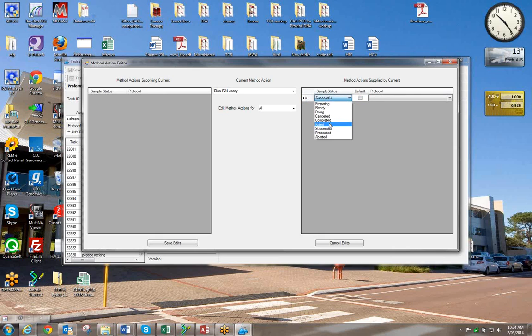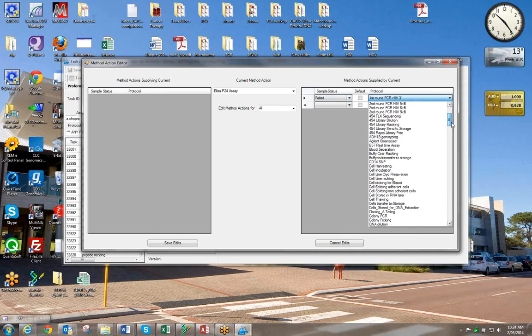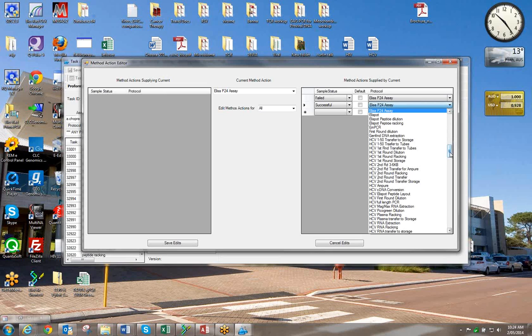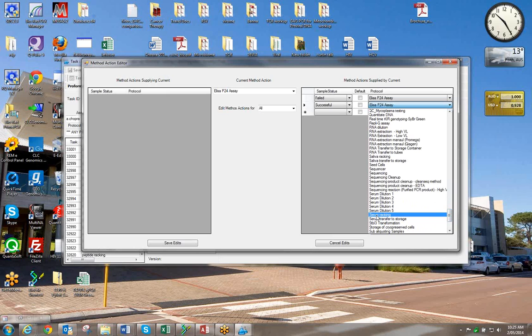So suppose it's failed, I want to go back and do the ELISA assay. If I want to go and repeat, either I might want to grow the cells again or do whatever, but I might want to go and repeat the failed assay. But as a successful, do nothing. Or if I say, oh, I want to go and do a dilution of my sample after I've done my serum ELISA, I might want to go and do a dilution of my serum. So then I can go in and say, allow me to do a serum dilution.